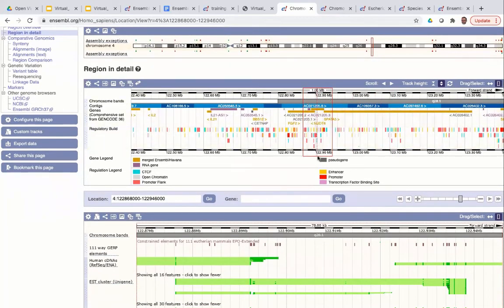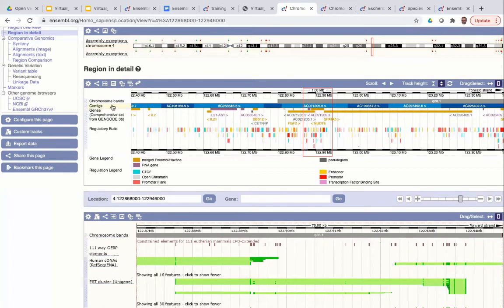Underneath is the one megabase overview, beginning to focus in on our region of interest. Our start coordinate is on the left and our end coordinate on the right, with data organised into tracks. The first important track is called the Contigs track — the genome assembly itself. You can see one contig in light blue, another in dark blue, and another in light blue again. The alternating light and dark simply shows how genome contigs are arranged next to one another. In between contigs, the sequence is just continuous — there are no gaps here.